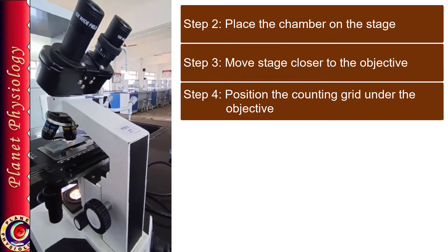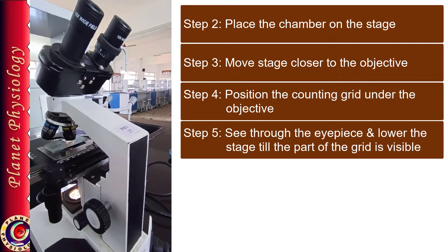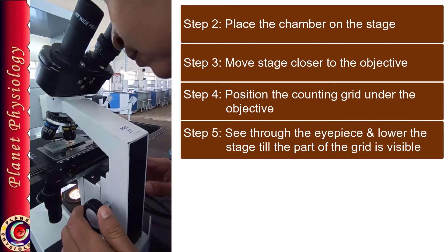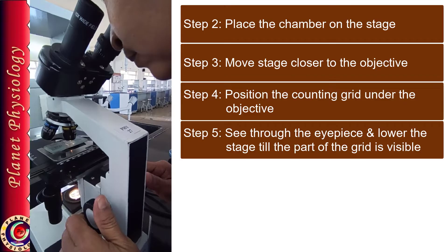Once this is done, now do not touch the mechanical screws. Now see through the eyepiece and only lower the stage with the help of coarse adjustment screws. For routine compound microscope, the body tube will move. So use coarse adjustment to move body tube up.